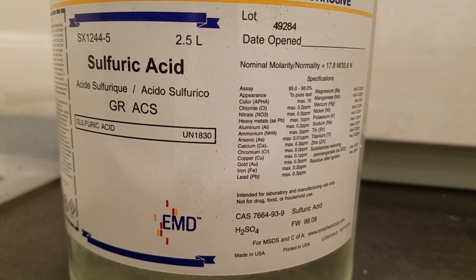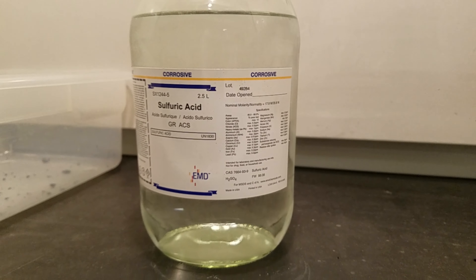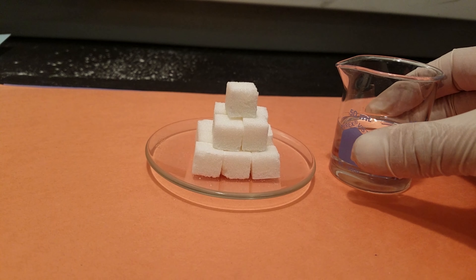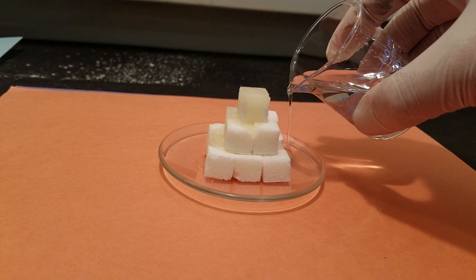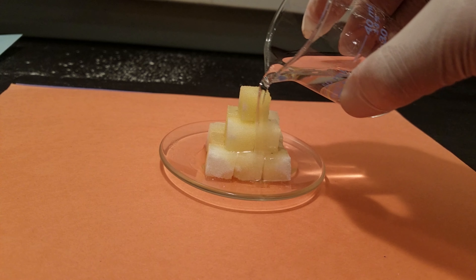In this experiment we will be using sulfuric acid which is 17.8 molar concentration, and I will be using just sugar cubes. I will pour some sulfuric acid on top of those sugar cubes.